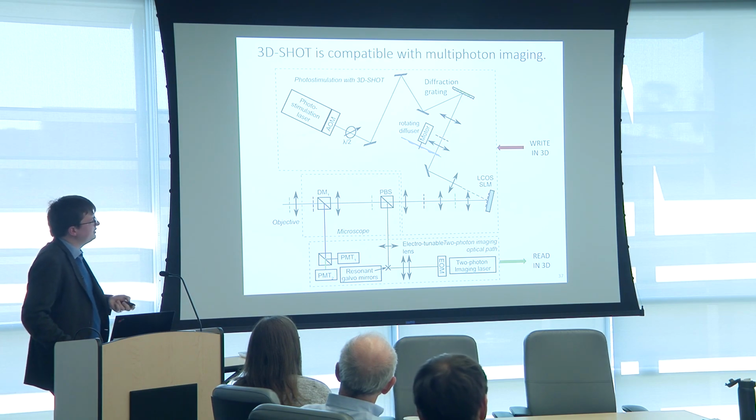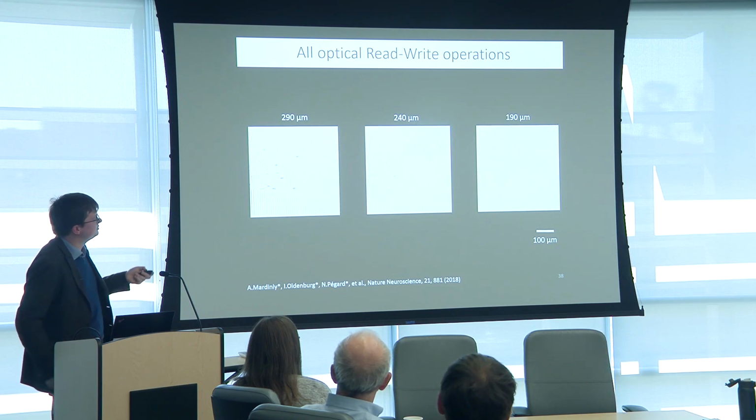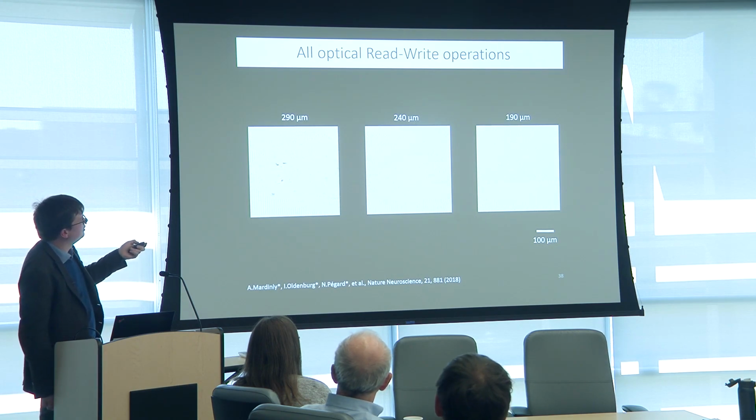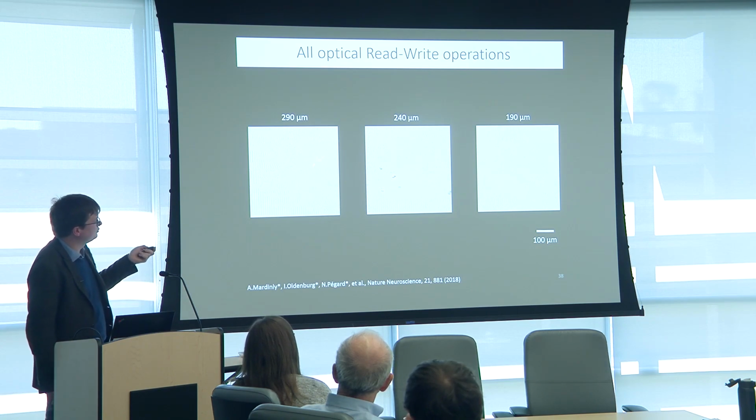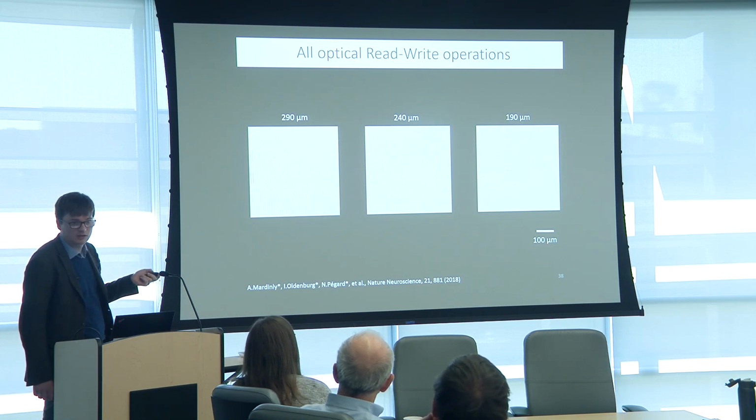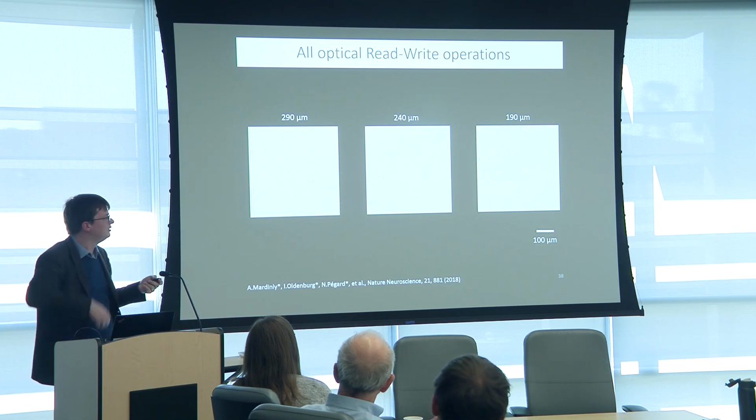And so with that device, we've been able to acquire that type of data. So this is mouse brain. The limiting factor for this technique is really the imaging. So we are only able to image 3 planes at a time and visualize those 3 stacked planes.